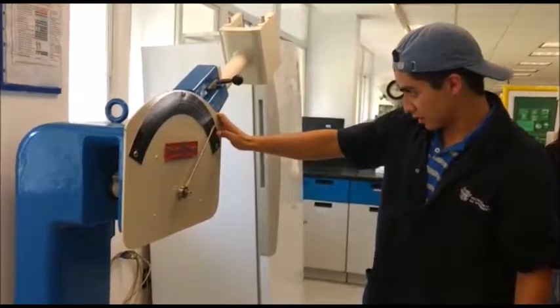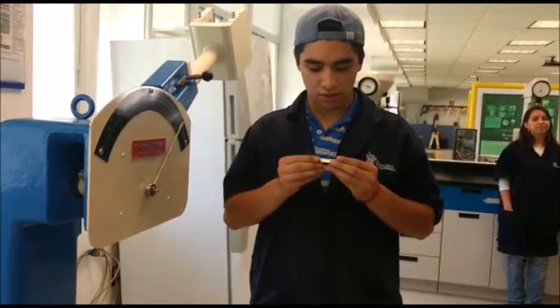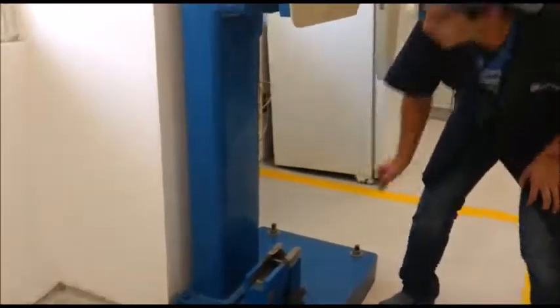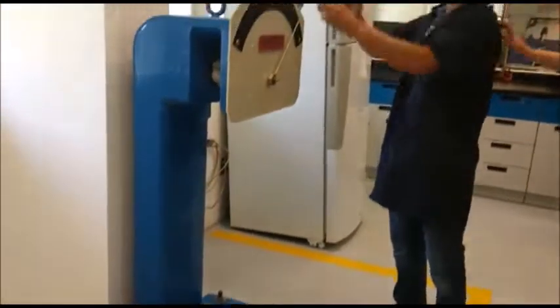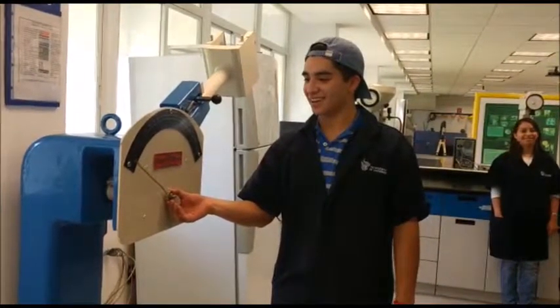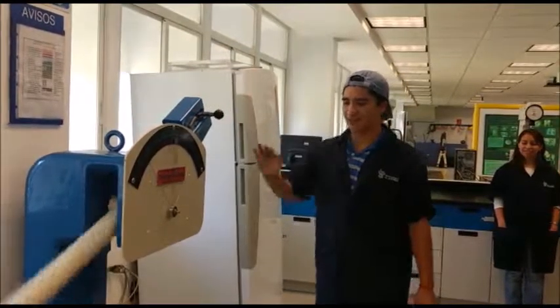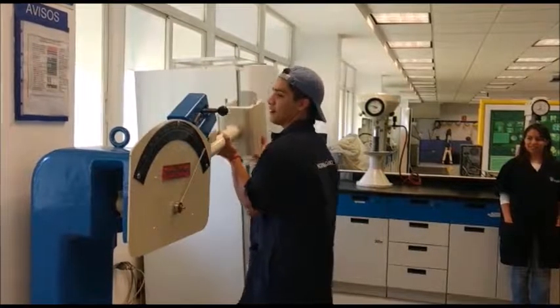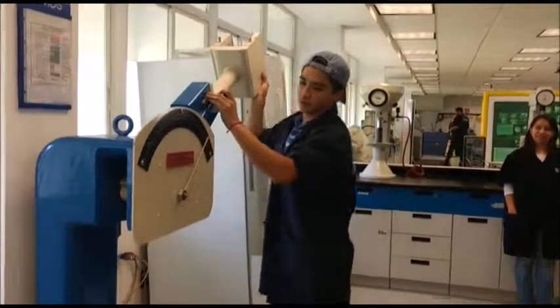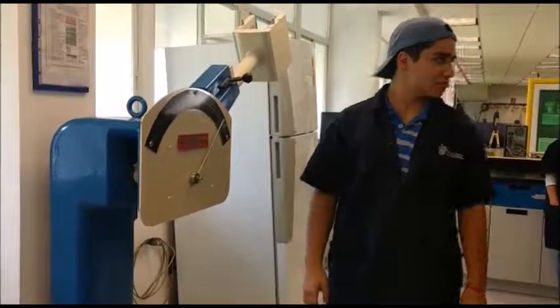And it's like 48. Now the 1018. We need to set again the indicator. And it's like 47.